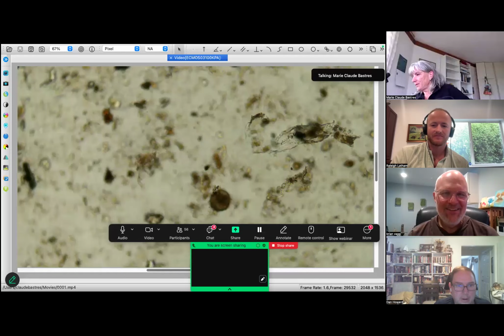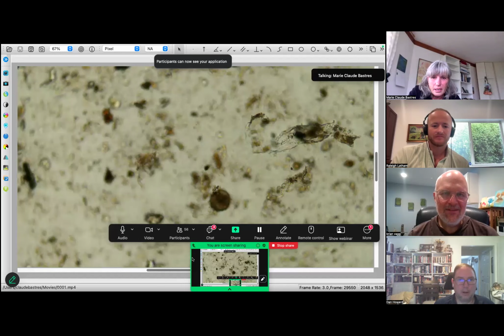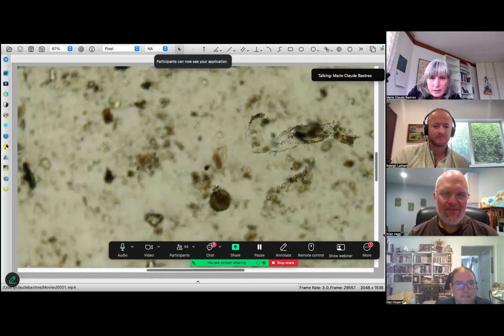Okay. I was waiting for a long time. Oh, did it dry out? Oh, yeah, bummer, but let's see. I have one right there. I am in 10x. Can you see Marie there?